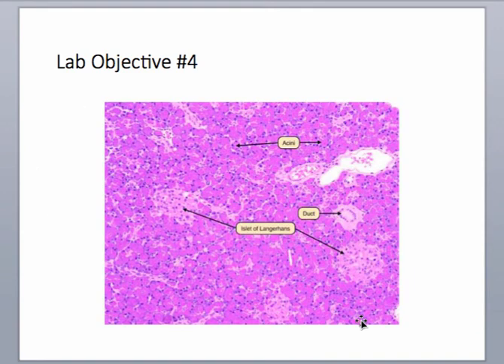So microscopically, we will see those acini are going to be almost kind of these darker donut-shaped structures, whereas the islets of Langerhans are going to be these clusters of cells together. Now we can't tell which are alpha and beta cells on the microscope, but you should know that the whole thing is the islet of Langerhans, and it's made up of alpha and beta cells.